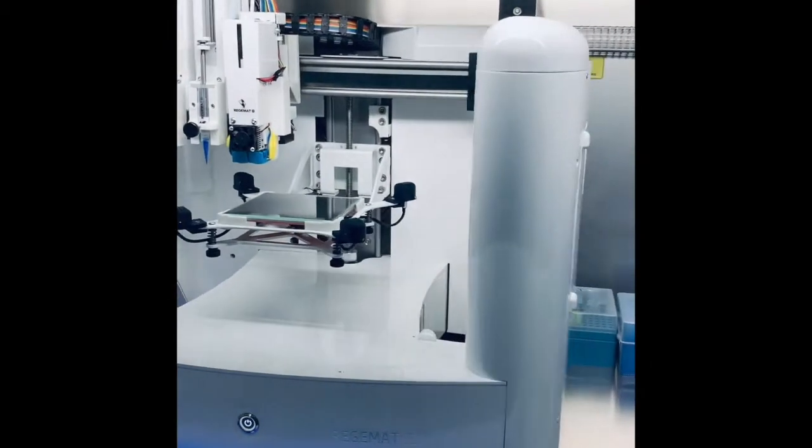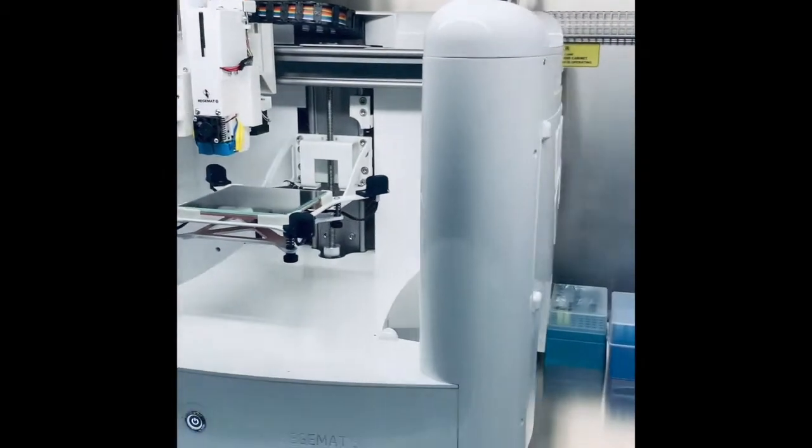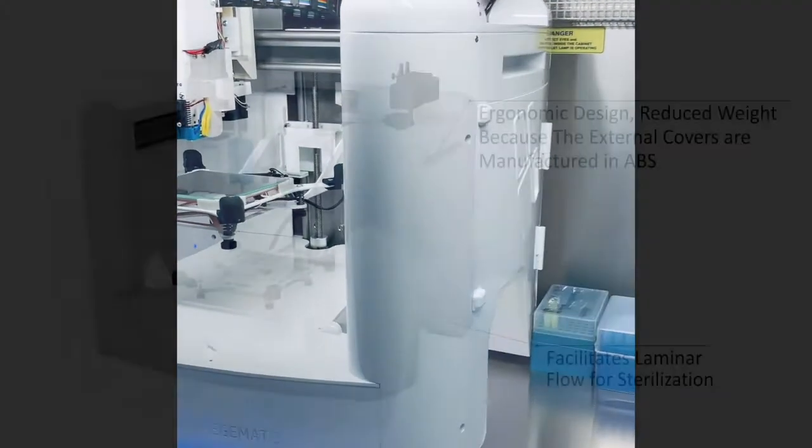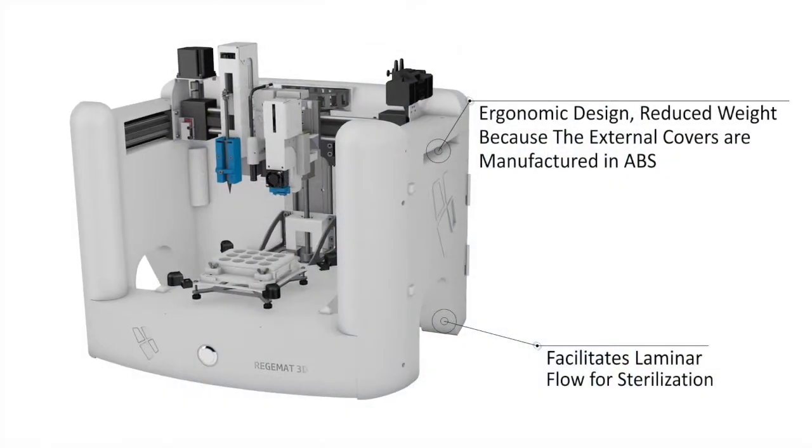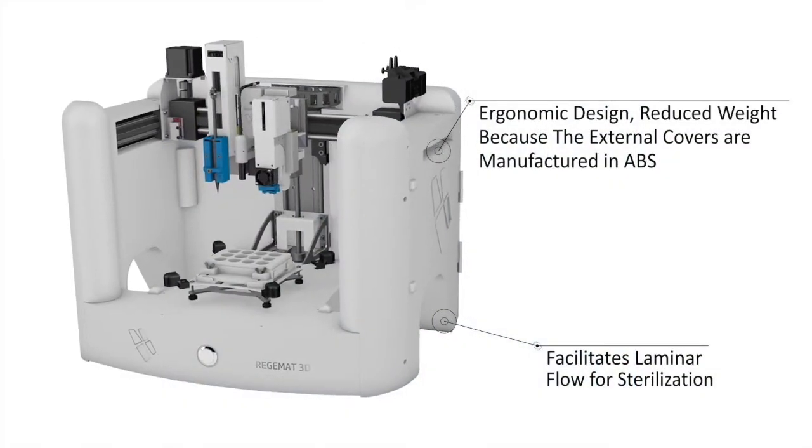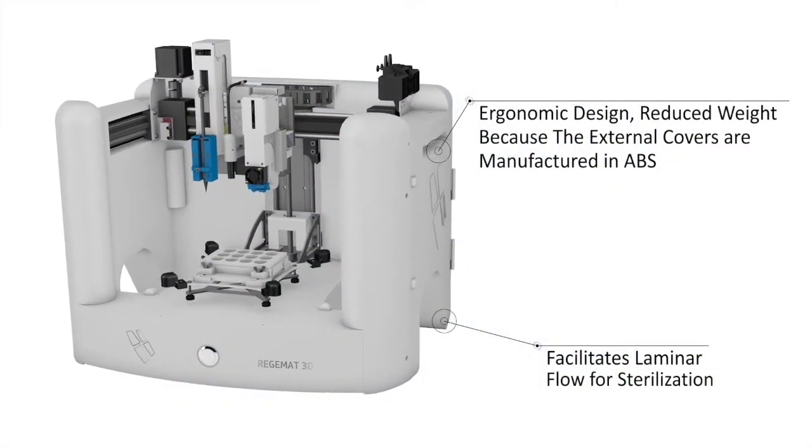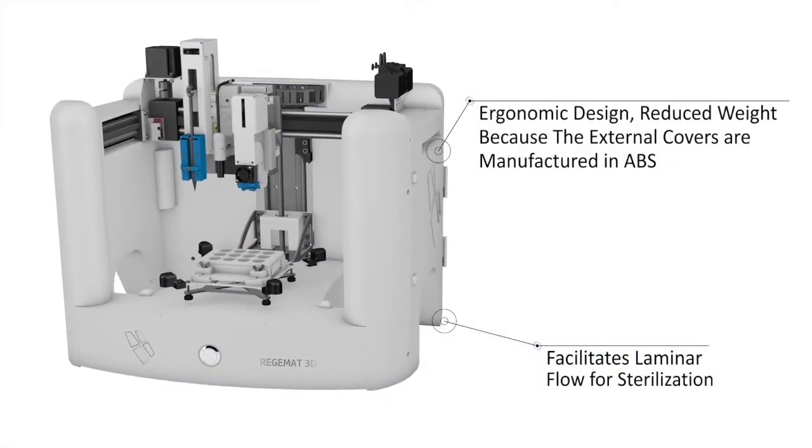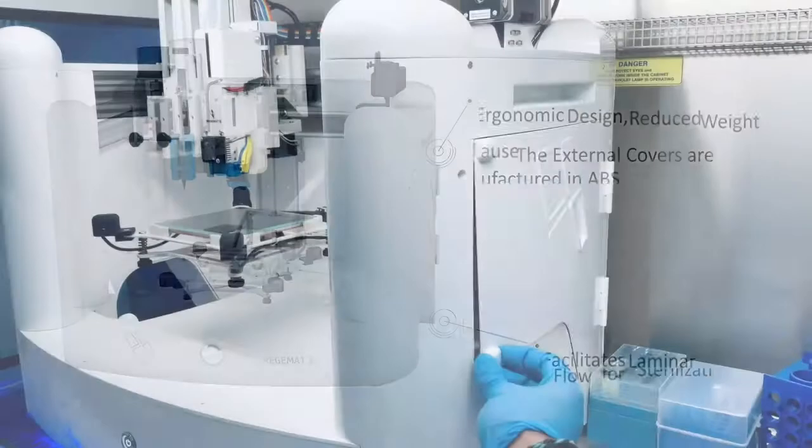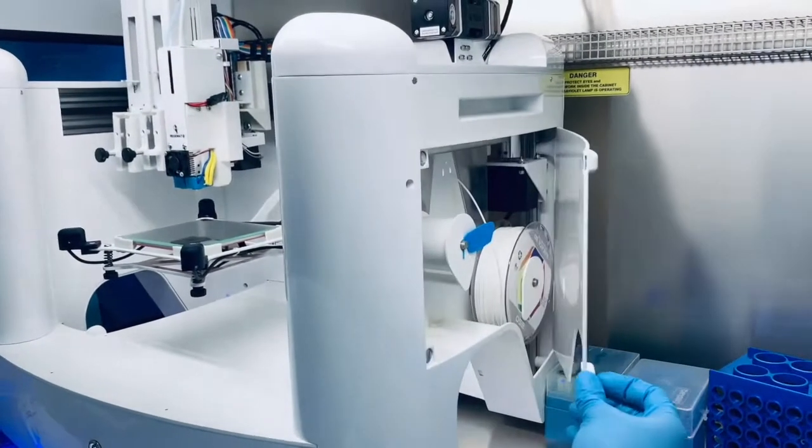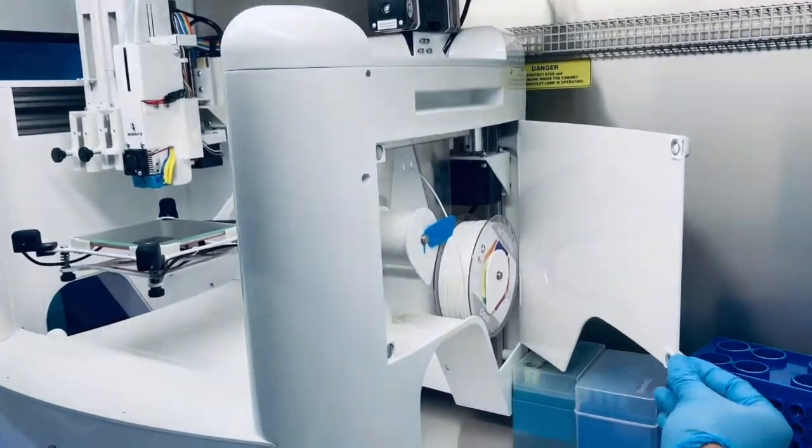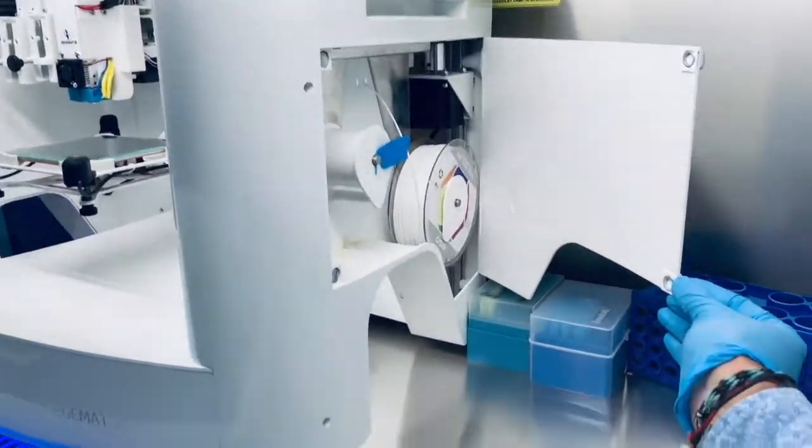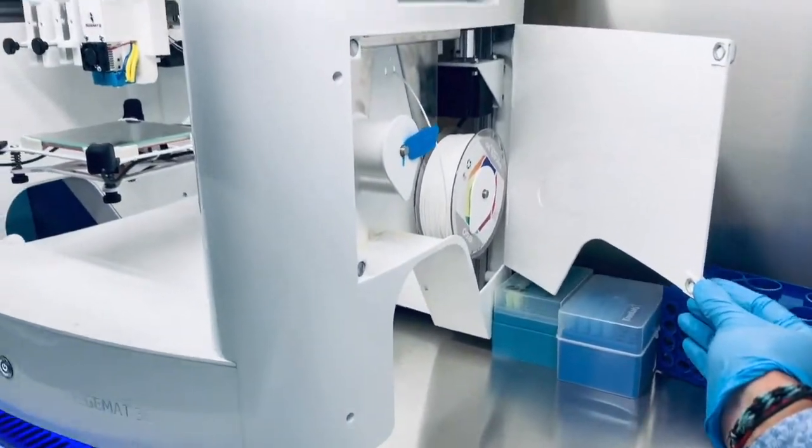In addition, we ensure that the aseptic conditions are maintained during the whole bioprinting procedure by including two lateral openings that facilitate the laminar flow while working in tissue culture cabinets.